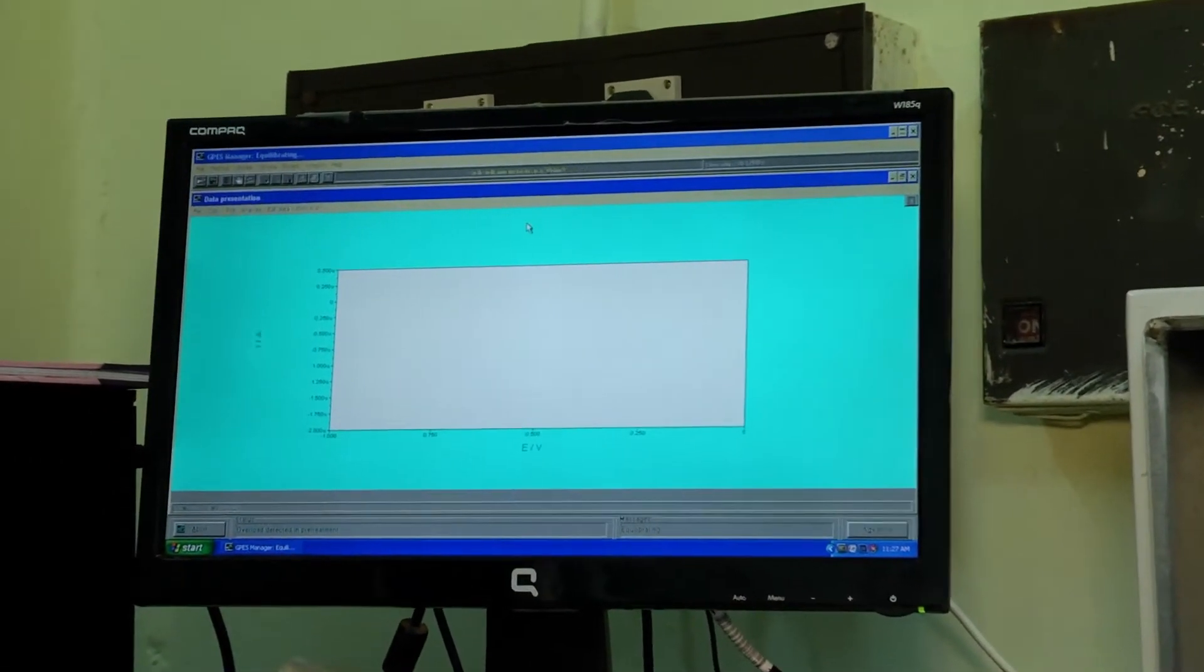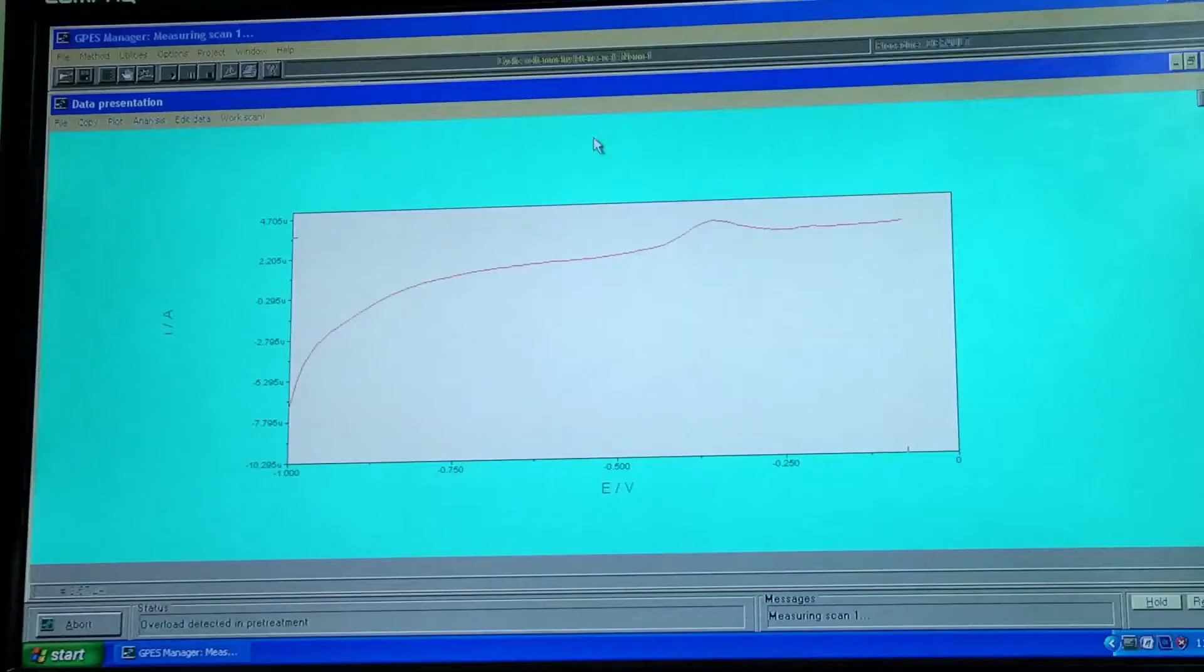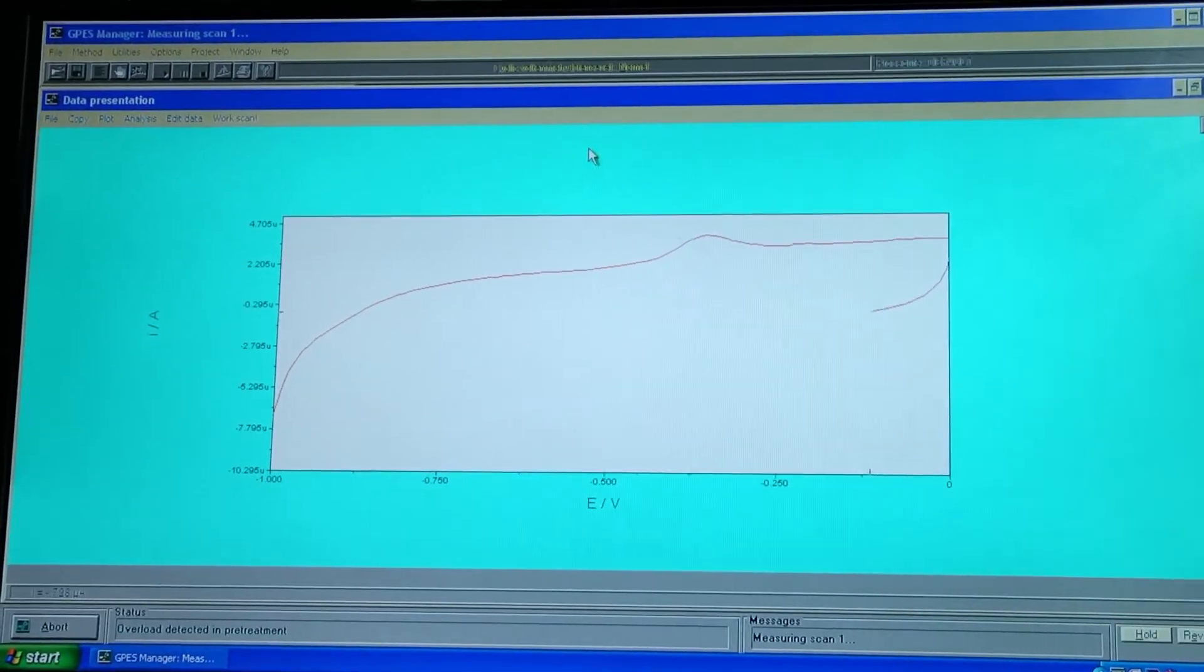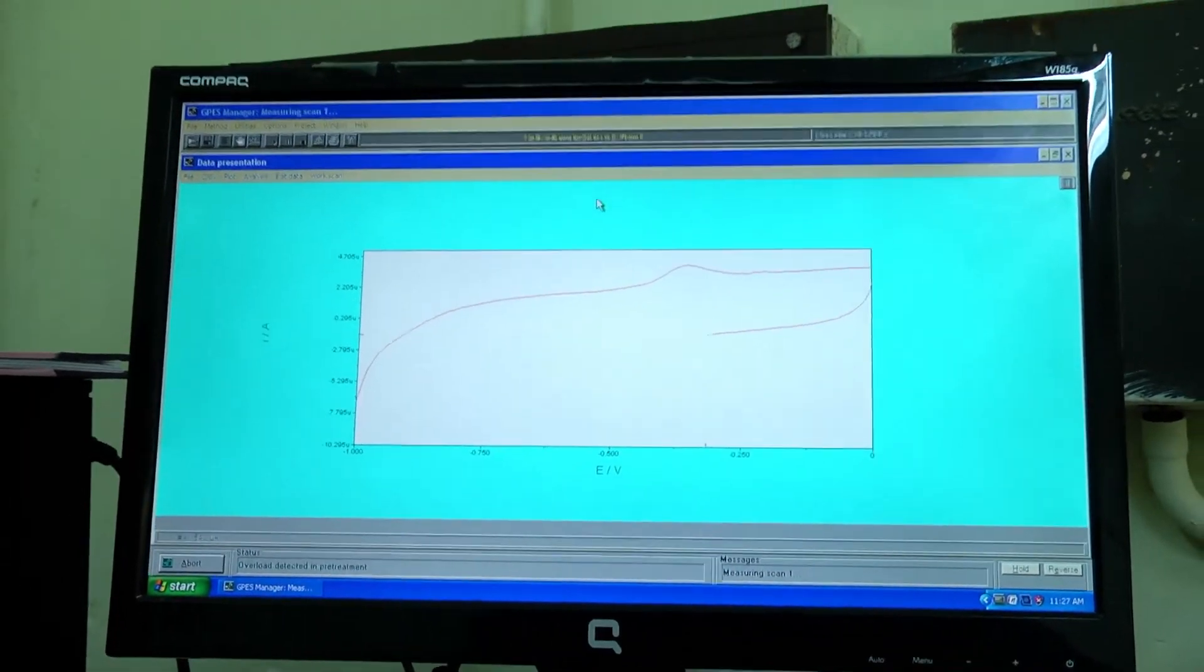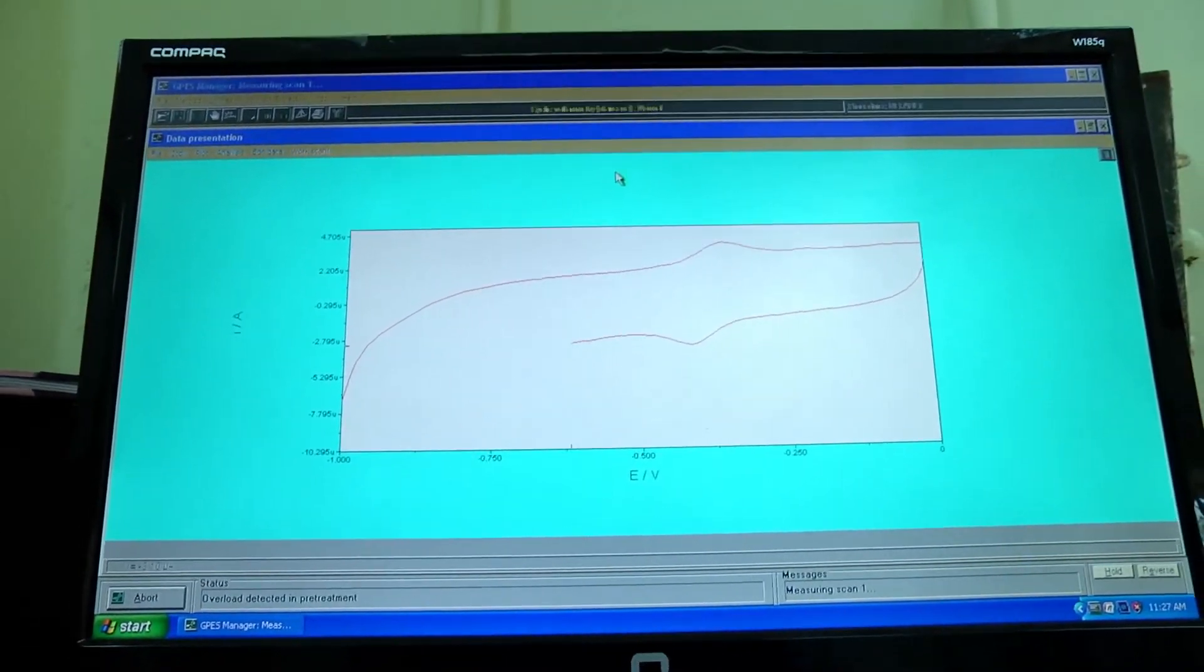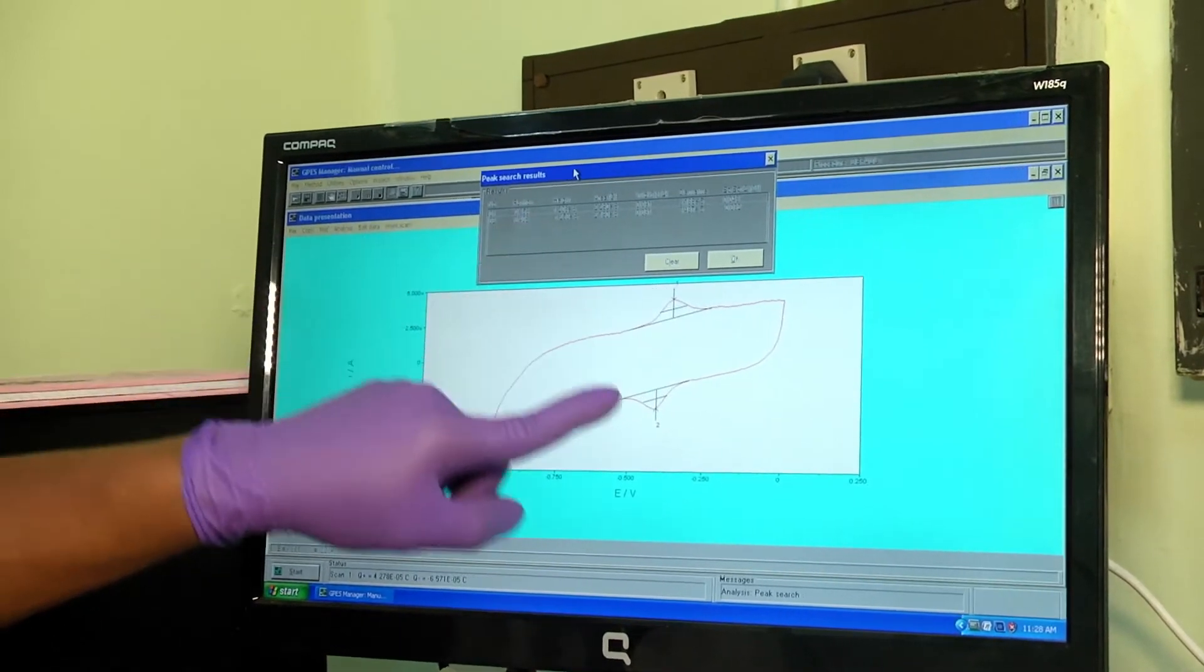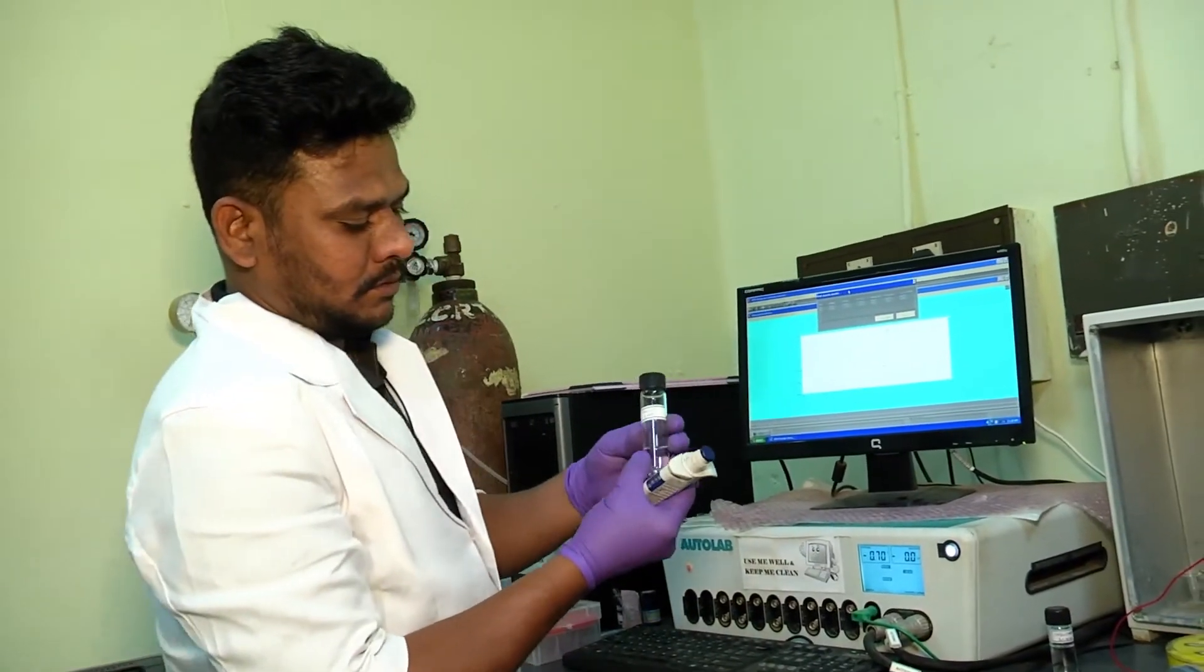During CV analysis, one can see the appearance of beautiful redox peaks, the formation of peaks in both the forward and reverse scan direction. This arises due to the redox species namely flavin adenine dinucleotide FAD and FADH2 present in the enzyme. One can measure the loading of enzyme on the electrode surface by measuring the charge under these redox peaks.